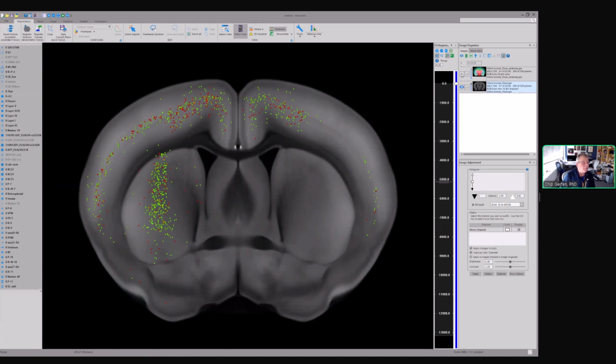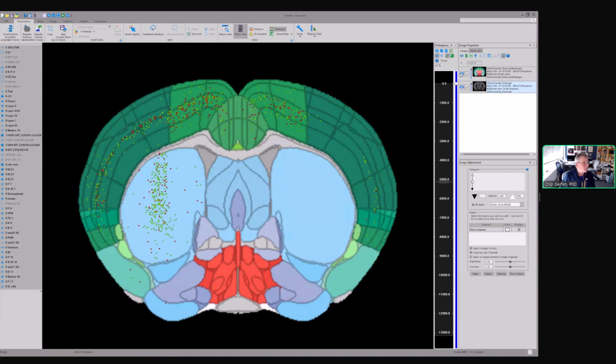And the Allen atlas then is parsed into about 2,500 different structures that are all laid out. Then for each of these structures, the number of each type of neuron is counted and actually provided in a spreadsheet that contains specifically the number of neurons and other information about those labeled neurons throughout these 2,500 sections.